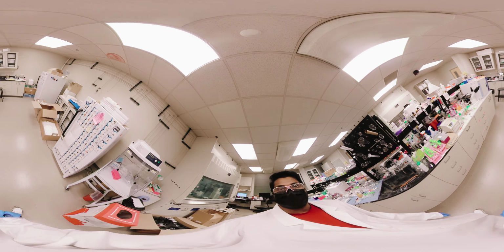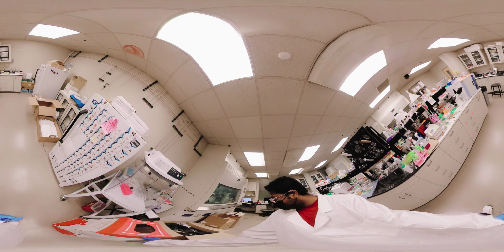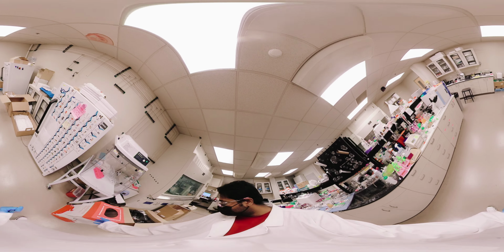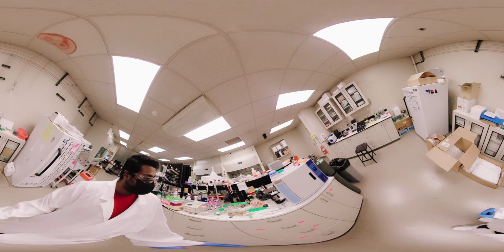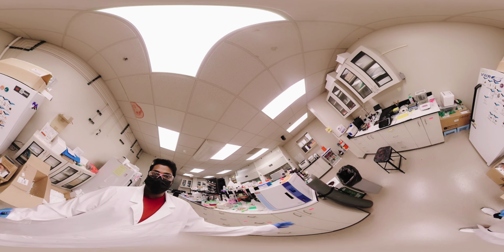We do not throw any chemicals in the sink. We also have a cell biology specified compartment where we only do cell biology. When you are doing cell culture work, you only throw the material over here, not in the other portion of this lab. We also have an incubator where we grow our cells.